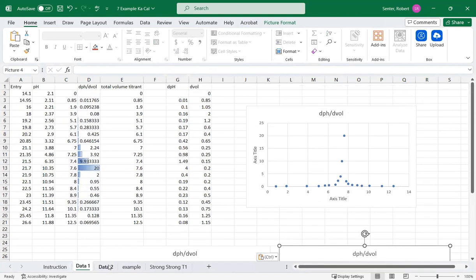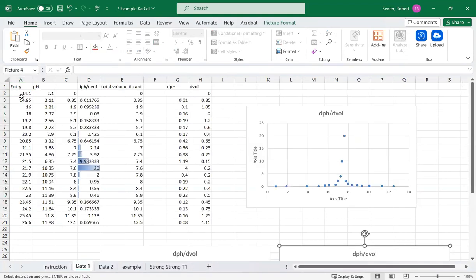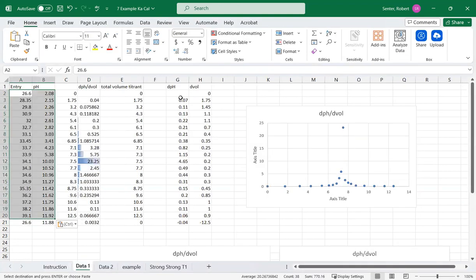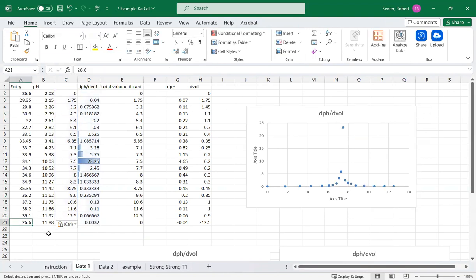All right. So now that I have everything done, you'll do it for all your trials. It's super easy then. You just want to copy and paste the data into it. And so I'll paste it into here. Everything is all referenced, it's doing things. But there is one problem. See how when we paste, it doesn't go all the way down. So one thing is that if you go further, maybe you don't collect all the data, or you might see that jump in there for the data here.